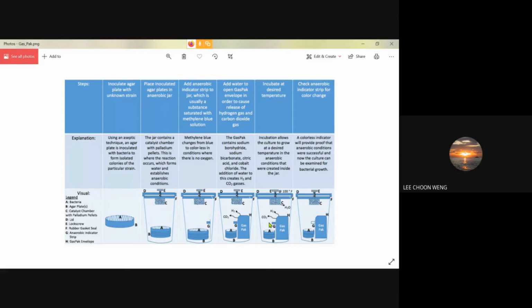It's very rare for you to get true obligate anaerobic bacteria, for example, Bacteroides or Fusobacterium, because these bacteria die quickly when exposed to air. So once the sample is here, at these stages, they would have probably died.